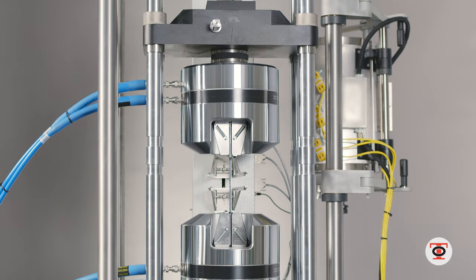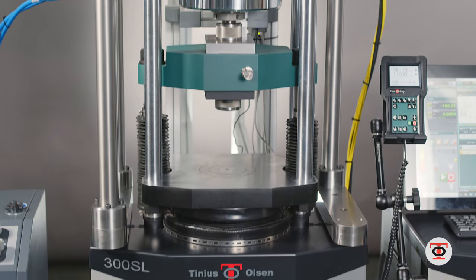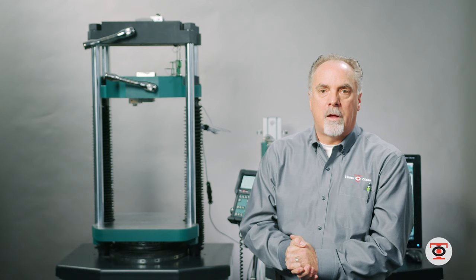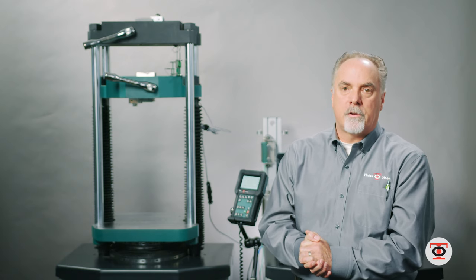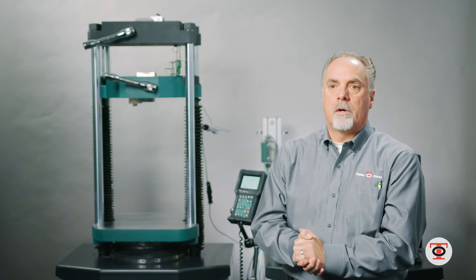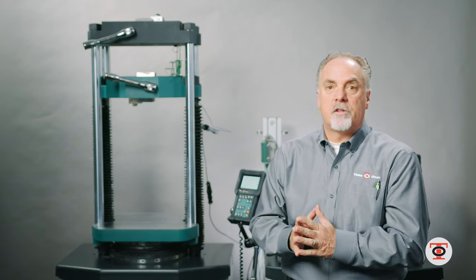The SL line is a low pressure system, so it never really gets hot. In a lab environment, it will remain typically around 90 to 110 degrees, which is not very warm at all. It will perform for years and years without having to change the oil.